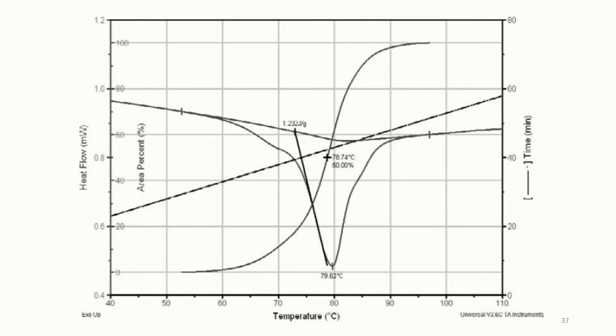So this is the elaboration of protein denaturation, and we can analyze the different concentrations by using the differential scanning calorimetric technique.